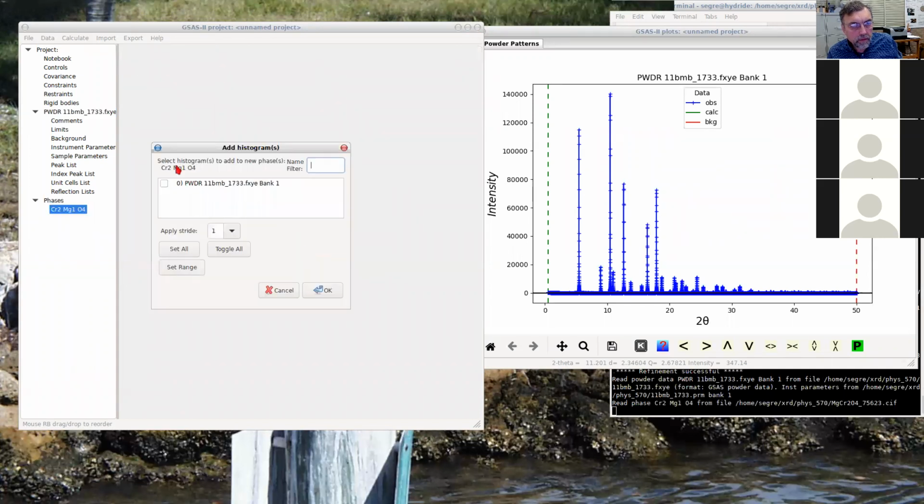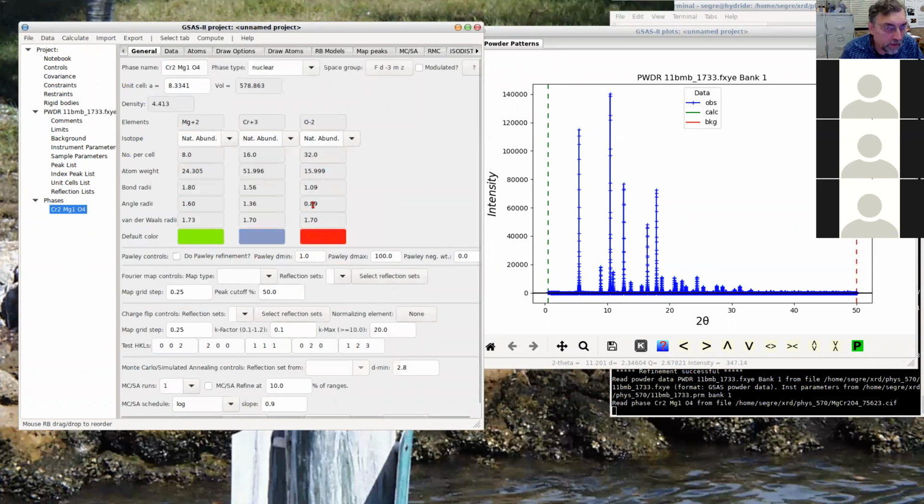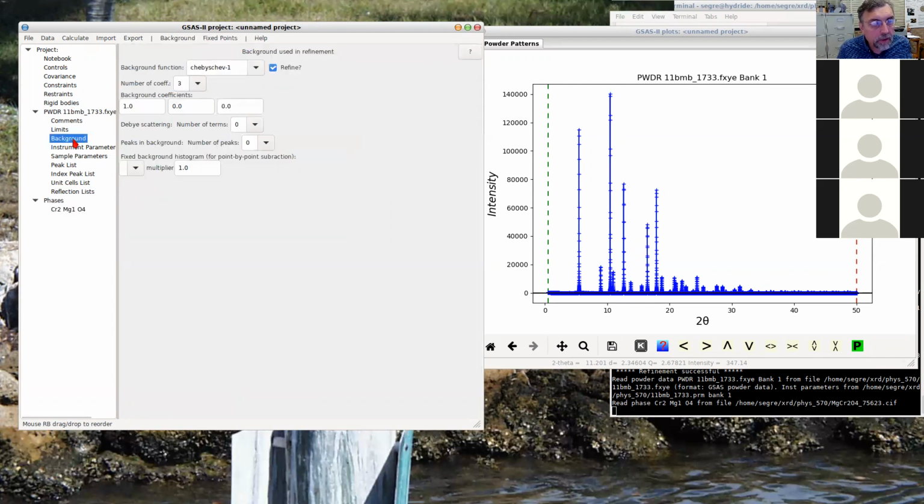That's fine. Associated there. And this is not uncommon that you have to go back. If you're not satisfied, you start fresh. It doesn't take you long and it's worth doing because sometimes you get into the wrong local minimum and you'll never get out again. So let me start by setting the background.